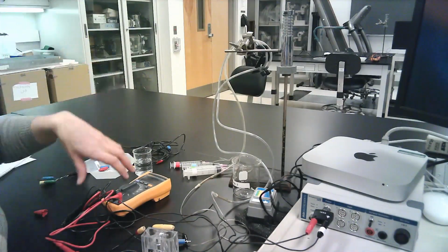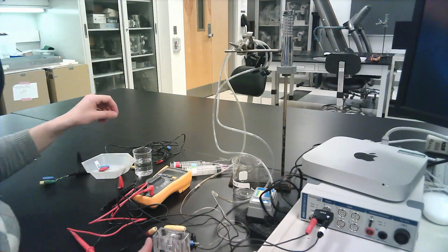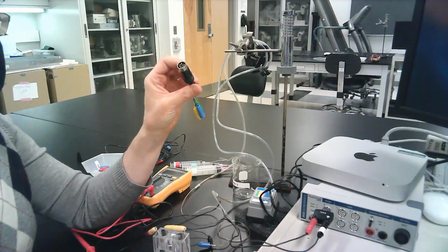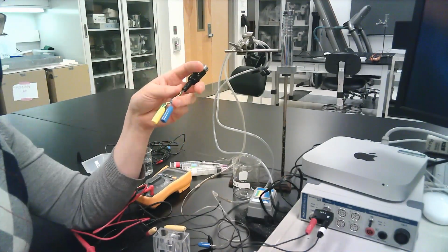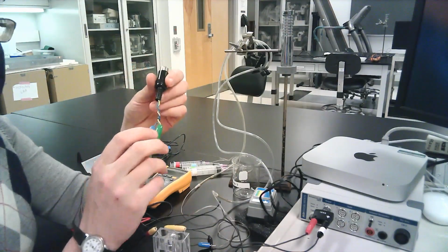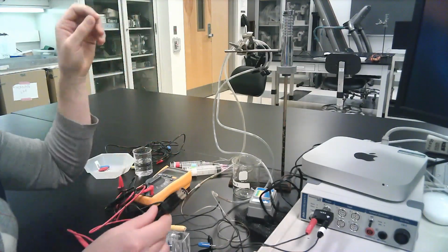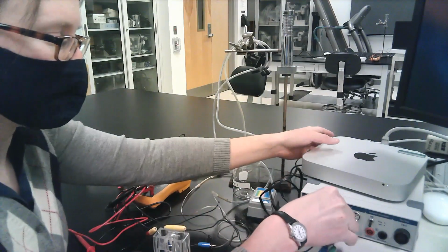So then the second circuit that we're going to need is our recording circuit. For this circuit, we've got a homemade custom connector that interfaces with the inputs on the Power Lab. These are a little bit fragile, so please be careful while you're handling them so I don't have to solder things back together again. For the recording circuit, I'm going to just plug this into input channel 1.